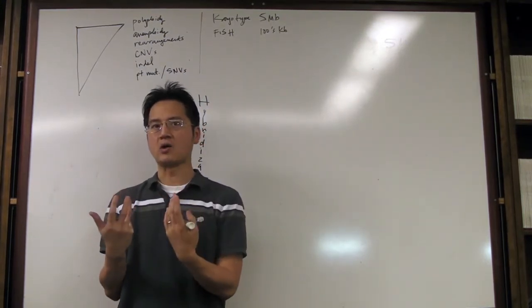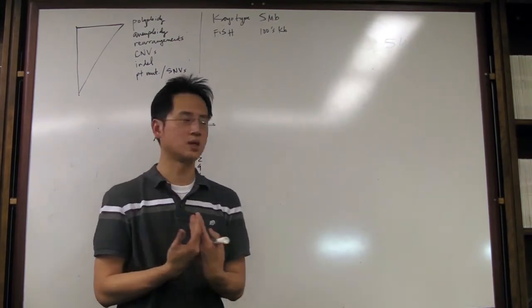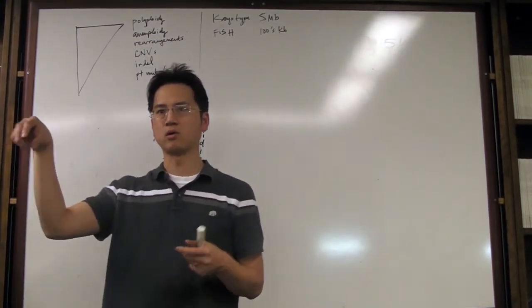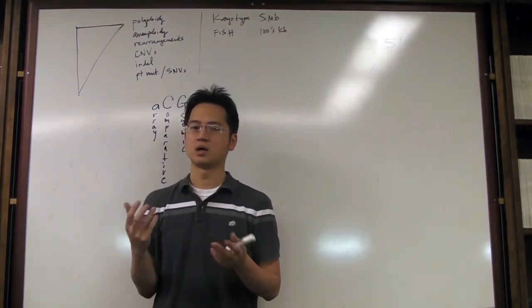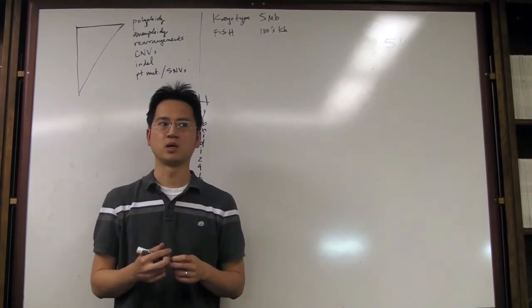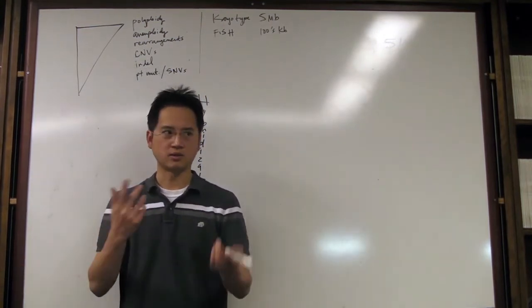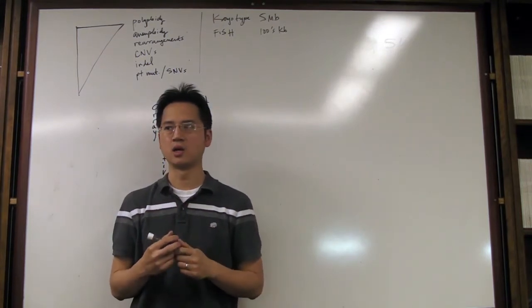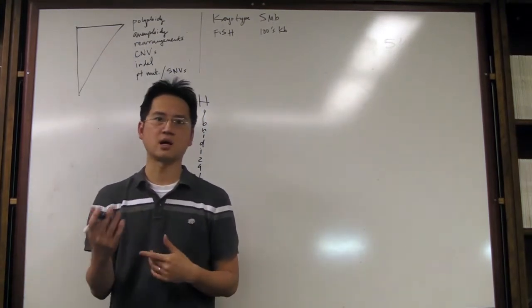different entities that can allow you to do very highly complex and high throughput, massively parallel sort of processes. So you can think of arrays as tissue microarrays. There you have many different cores on one array that you section through, and you're trying to do immunohistochemistry or FISH or some other sort of in situ assay in terms of analyzing across multiple different specimens at the same time. You can think of protein microarrays as a way to test maybe antibodies, or vice versa. If you have antibodies coding arrays, you can analyze many different protein analytes at the same time by using a protein microarray. Technically, there are no RNA arrays, but there are DNA arrays that can look for RNA expression.